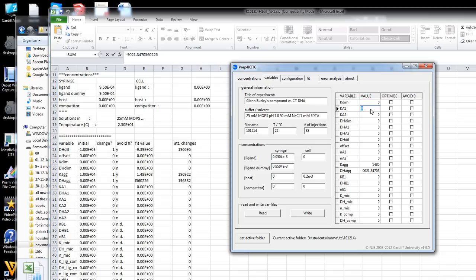So now the other numbers that we need to give is the binding constant. The binding constant, we're simply going to guess that it is approximately 10 to the power 5. So this is equilibrium A1. The enthalpy of the interaction, we see that it is exothermic, so we're going to say it is about minus 5,000, looking at your graph. And your stoichiometry, well, the stoichiometry here is about 0.5, but I'm simply going to say 1. It doesn't matter too much.